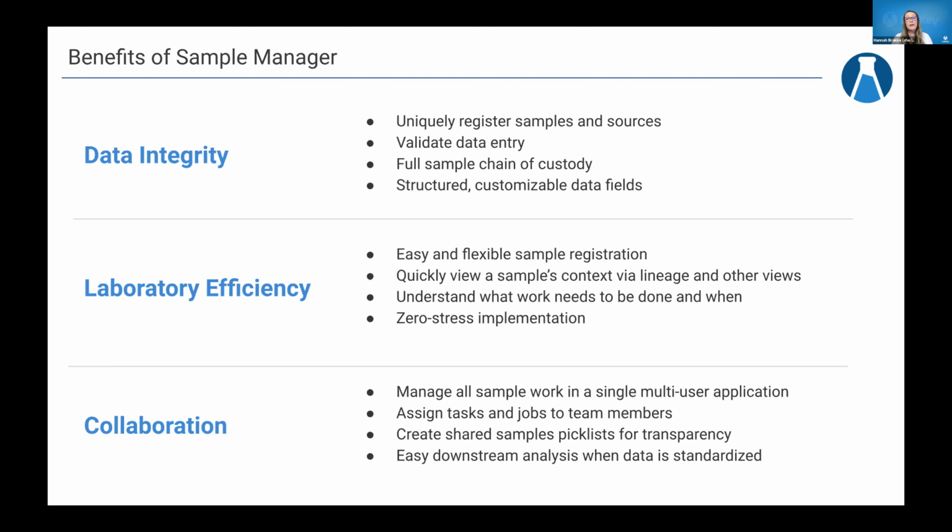You can also quickly view that sample context and lineage, as well as all of the samples that have been derived from a given source. And so that allows you to quickly make judgment calls on your samples while you're in the lab.